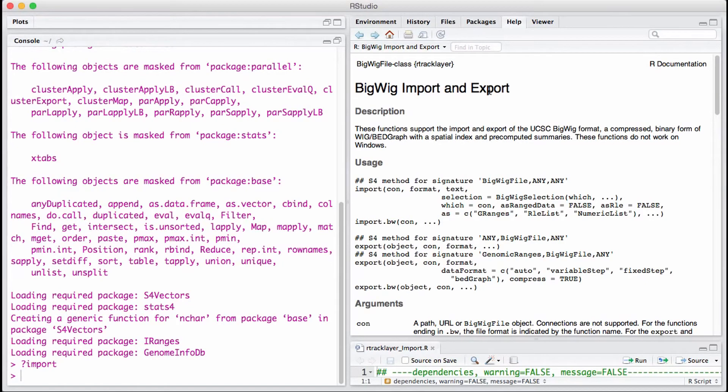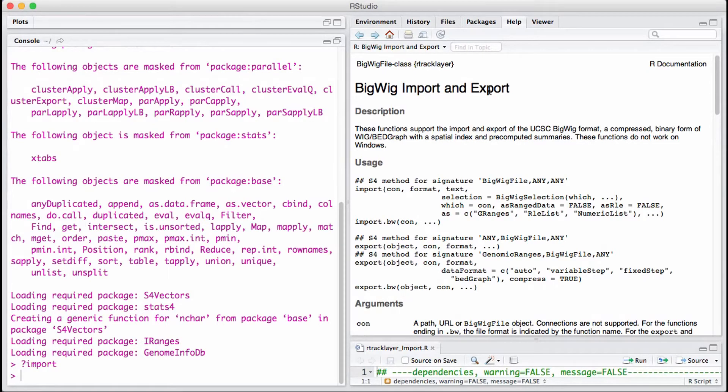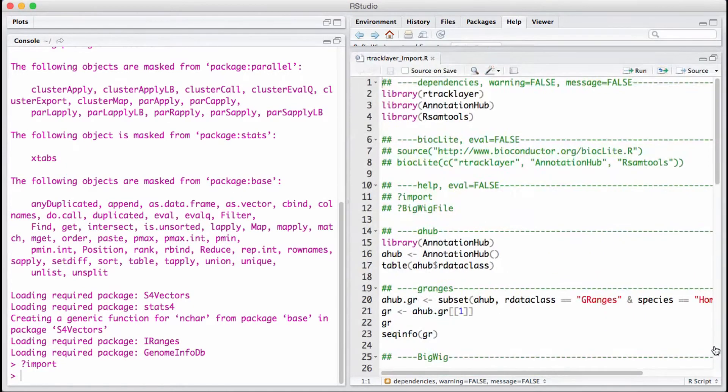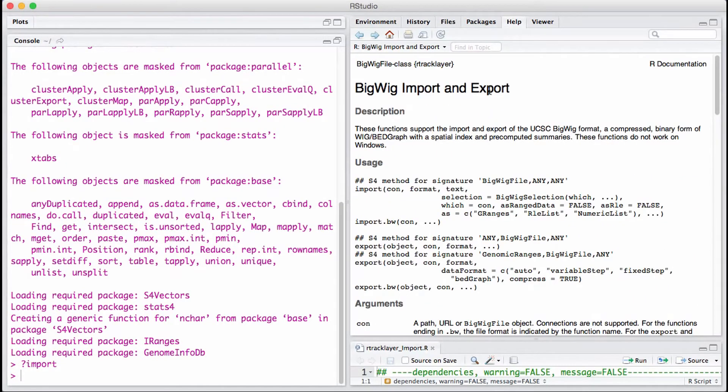We're going to look at the bigwig file. Basically, a wiggle file in our case has some sort of numeric value along the genome. A bigwig file contains a single vector across the entire genome, but it is compressed, and therefore it makes it easy to extract a specific value for a particular region.